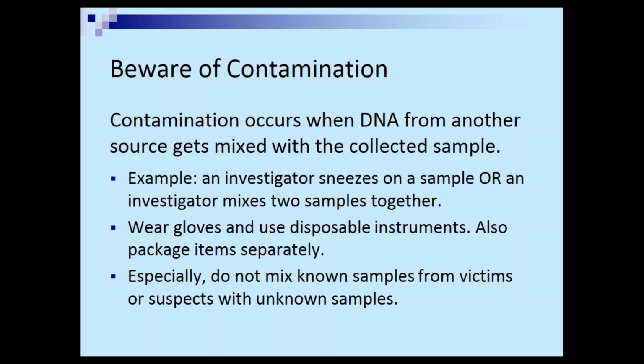So I think we went over this a little bit in the crime scene investigation, but it's worth re-mentioning here that you want to sort of protect the evidence from your own DNA. So obviously wearing gloves, using disposable instruments will help prevent cross-contamination. Not sneezing on a sample, but sneezing away from a sample is a good idea, or sneeze into your sleeve, again, with the illness season coming up.